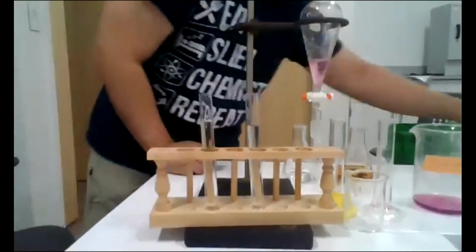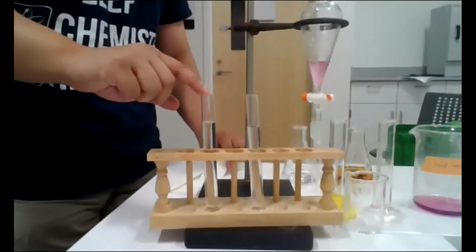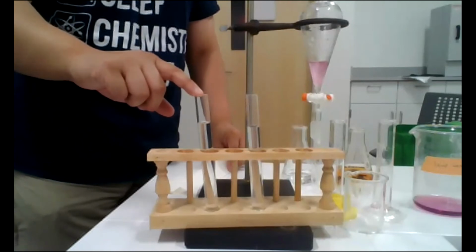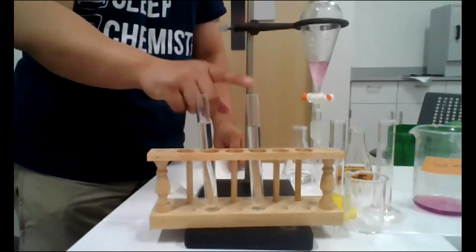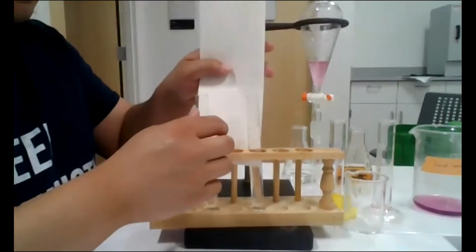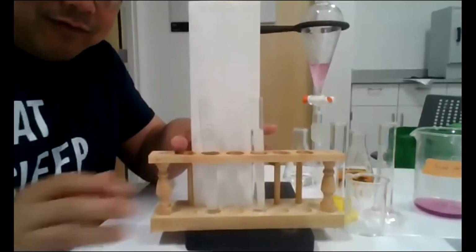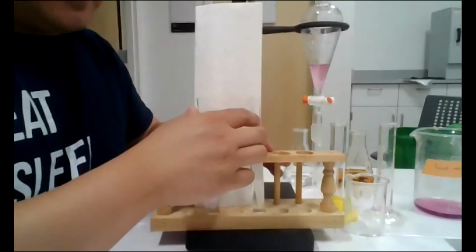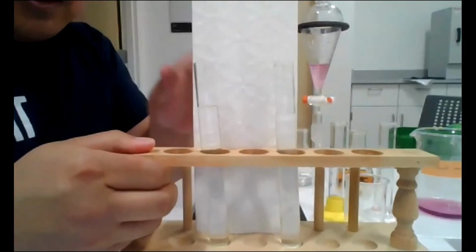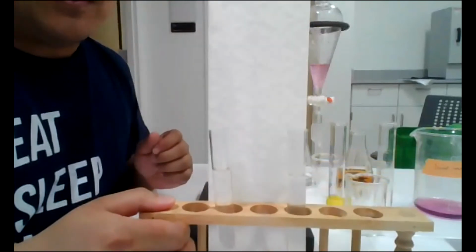Now, because we're not in person, I know it's super hard to see. This was our first extraction on the left, and this is our second extraction, the one we just finished. Okay, so the trick is maybe put a white background. But still, I really can't see a difference. The video is not really capturing the difference between our first extraction and the second extraction. Well, what do we do?